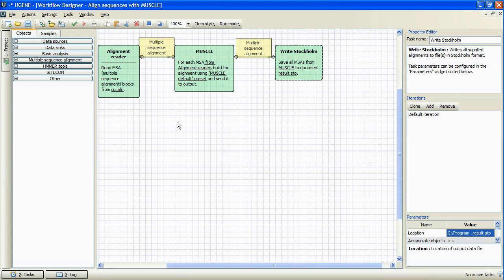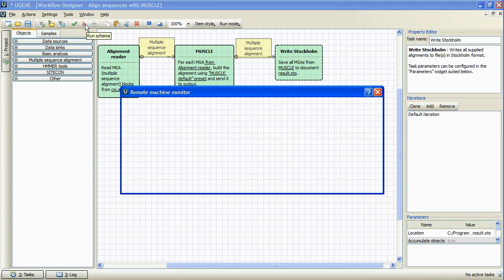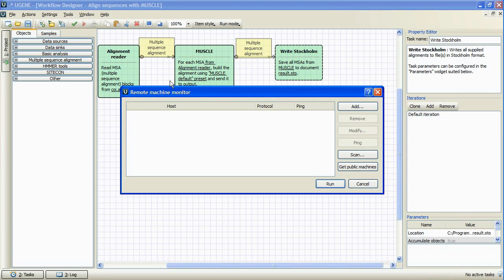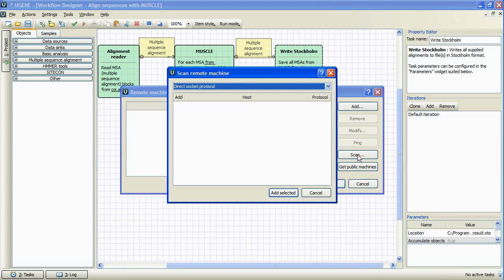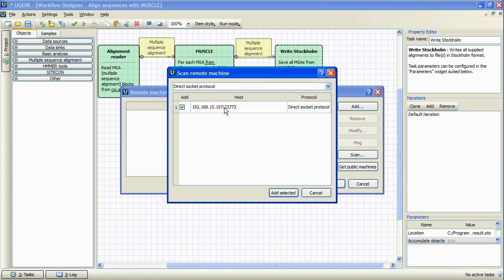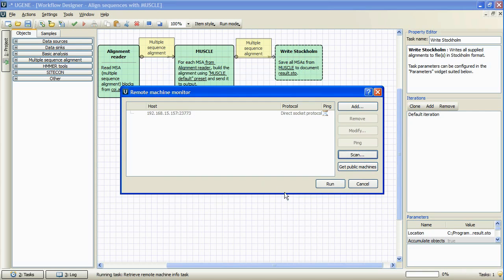When done, we press run schema button. The remote machine monitor dialog box has appeared, where we can specify the remote machines to run our task on. As always, the machines must be reachable from our local machine and have UGENE running on them.